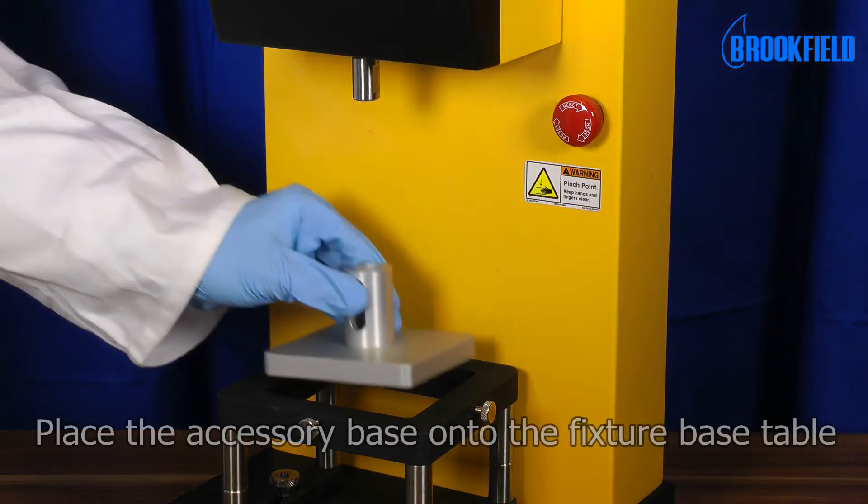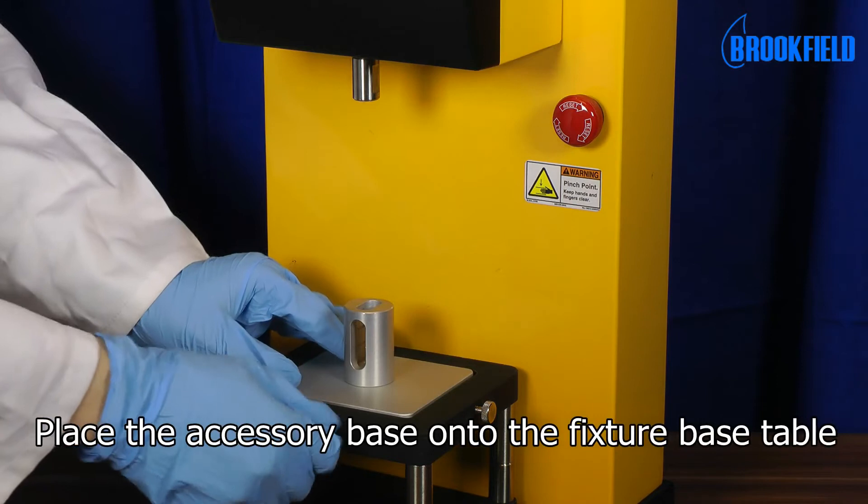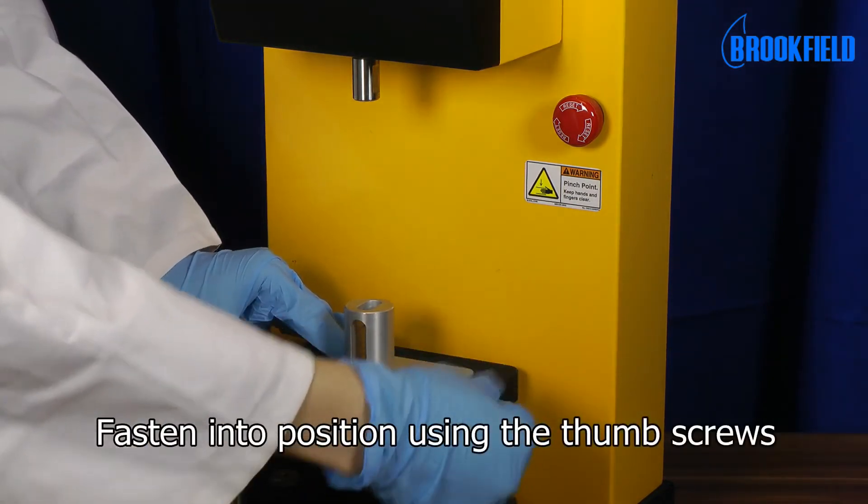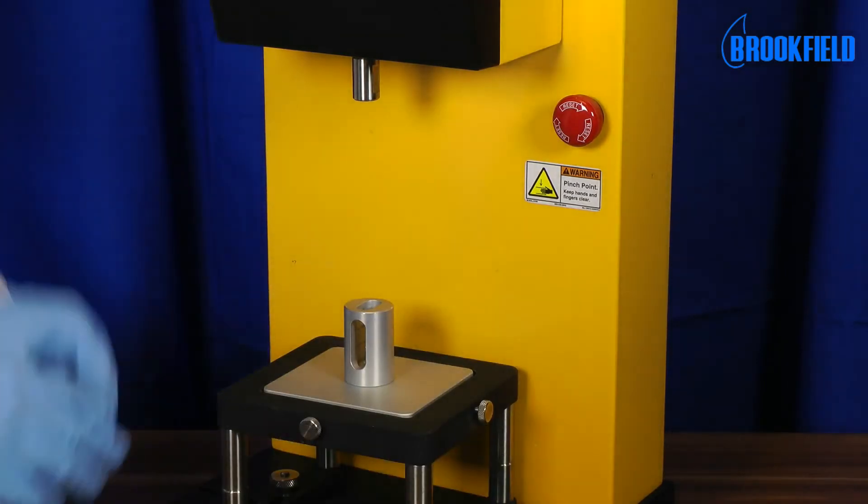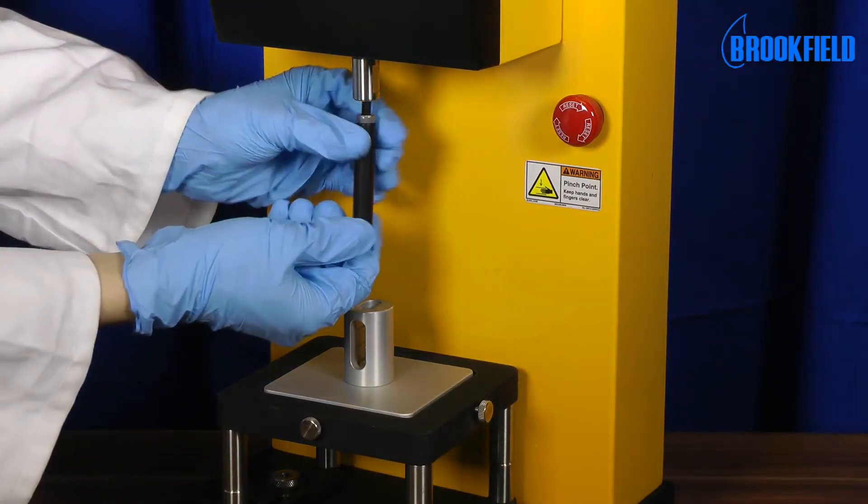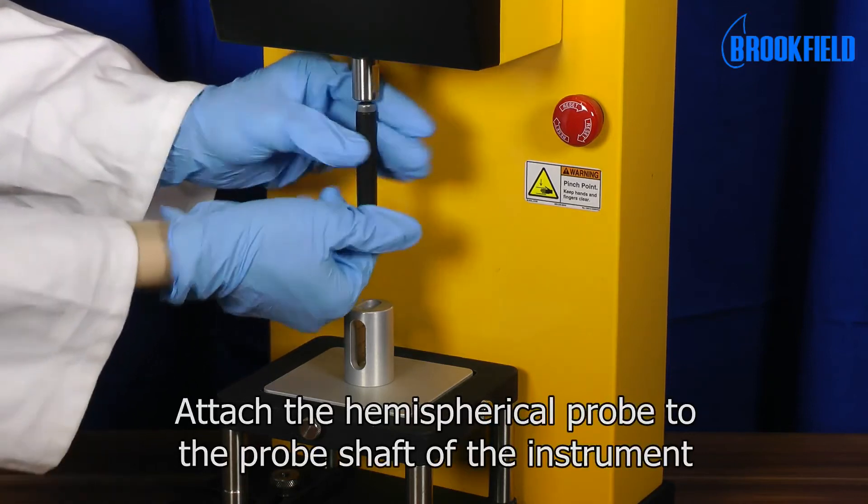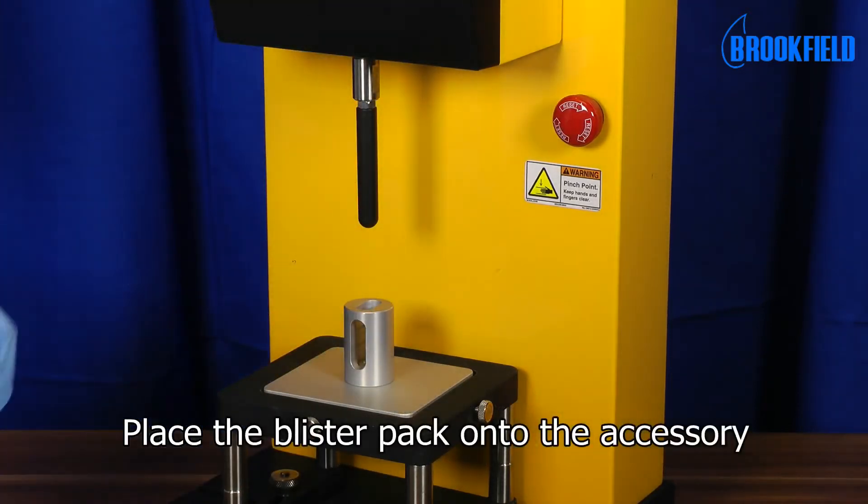To set up the test, place the accessory base onto the fixture base table and fasten into position using the thumb screws. Attach the hemispherical probe to the probe shaft of the instrument and place the blister pack onto the base accessory.